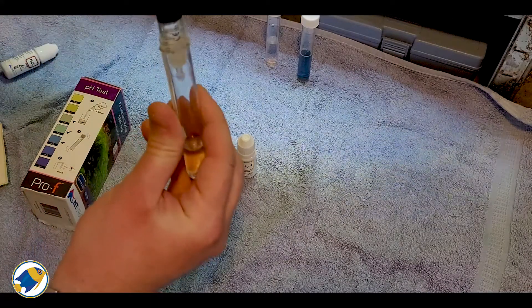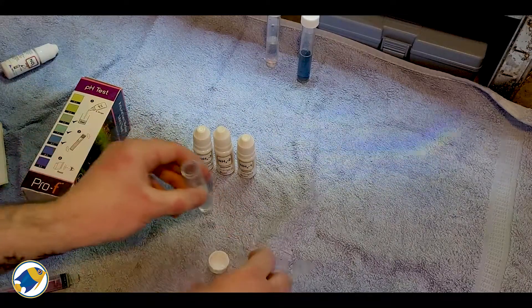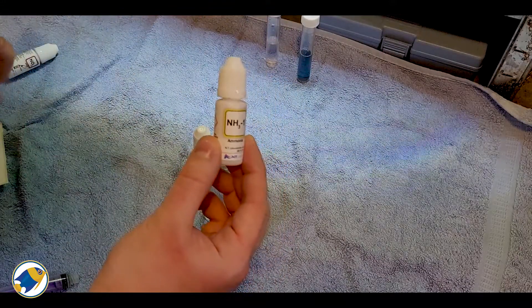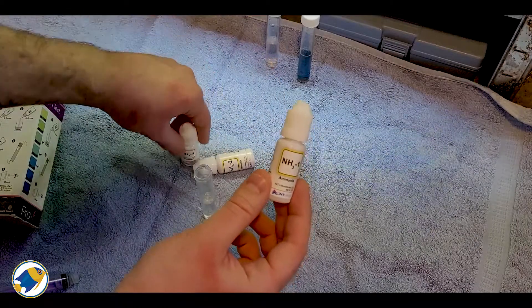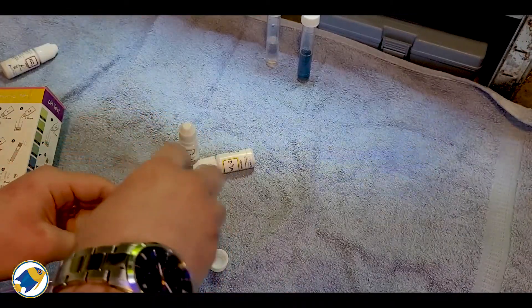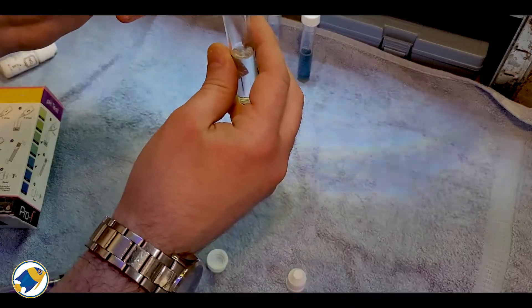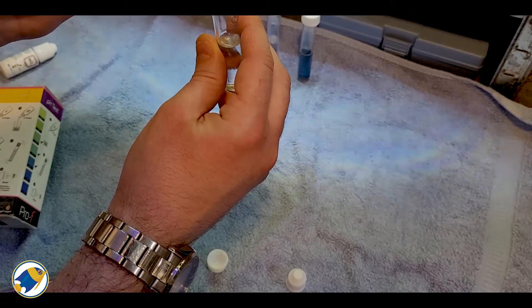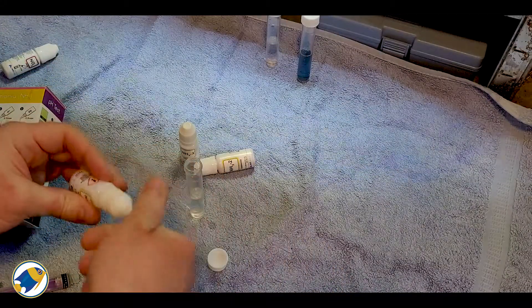And then lastly we're going to do ammonia. With the ammonia test you have to do five drops from bottle one, five drops from bottle two, and five drops from bottle three, and then you have to wait 10 minutes for this one. This is another reason these tests become a bit tedious — if you had every test available it's going to be a bit of a pain, because your house is going to look like a science lab.